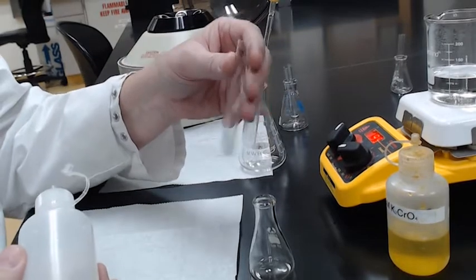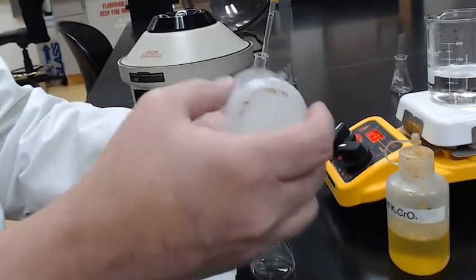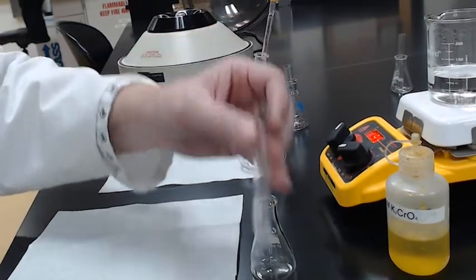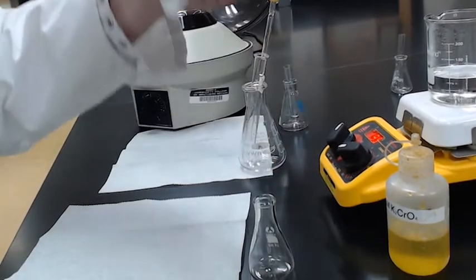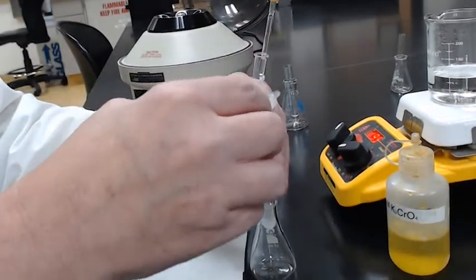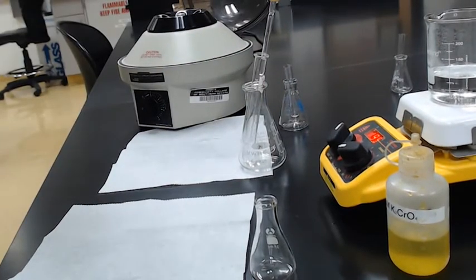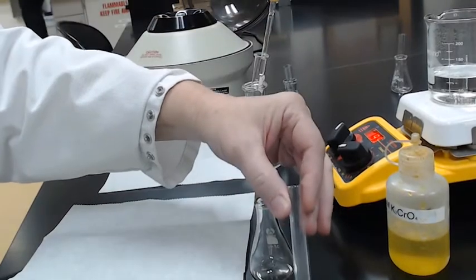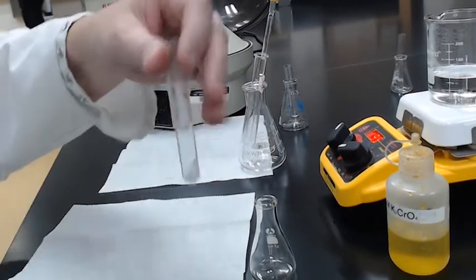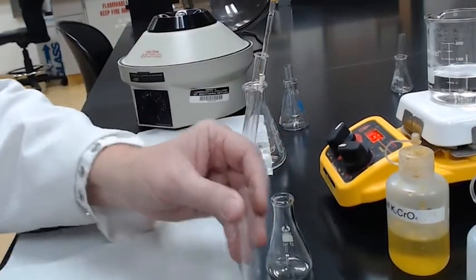2 drops. How much unknown did I put in here? 3 drops. Actually depends how much carbonate. Whoops, 4 drops. And you see the solid went basically almost completely clear. We're going to add 1 more drop and that should finish it. Unless we're getting a side reaction I don't know of. And add 1 more. Problem is every drop of acid means more drops. Oh, completely clear. Yeah, exactly, completely clear. We are ready to proceed.